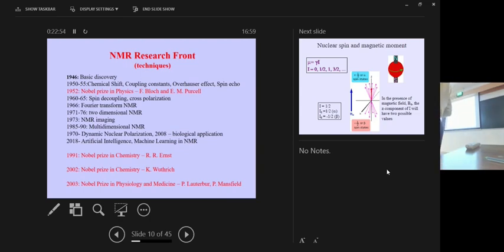And therefore, you can use the crystal structures for the purposes as well. Wherever you can determine the solution state structure, you do it. And if you can do it in a solid state, fine, well and good. You can do it there.